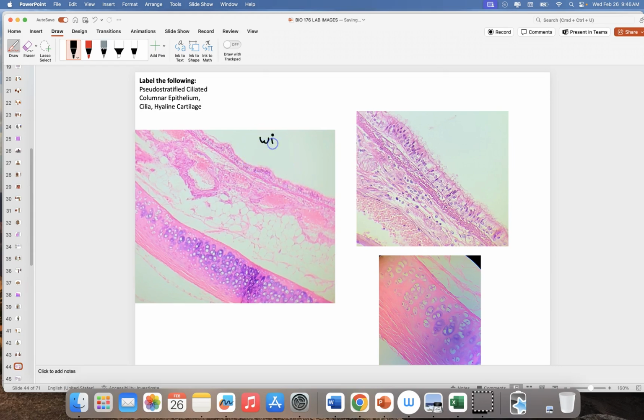In this case, this would be the area of the trachea or windpipe where we would see the passageway of air. We can go ahead and note that this would be that airway. This would be that open space. That means that this is the epithelium because it's going to be facing that internal space, that airway.